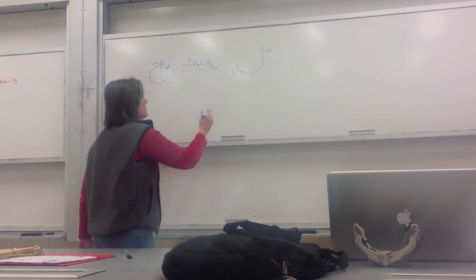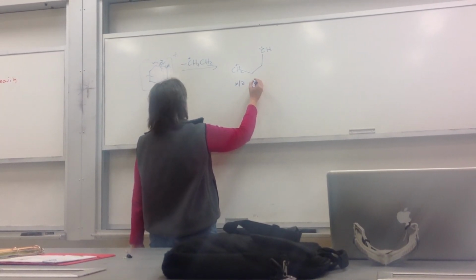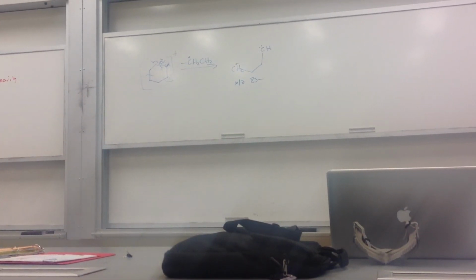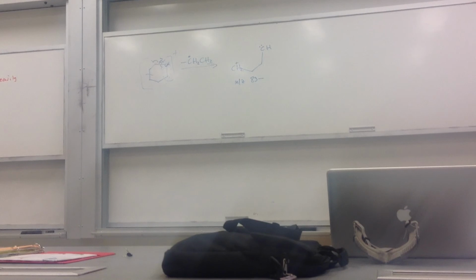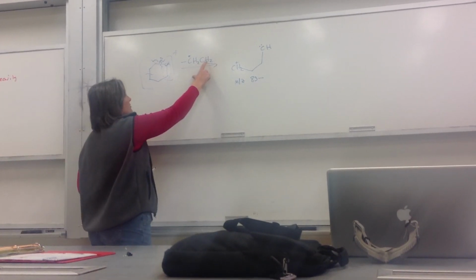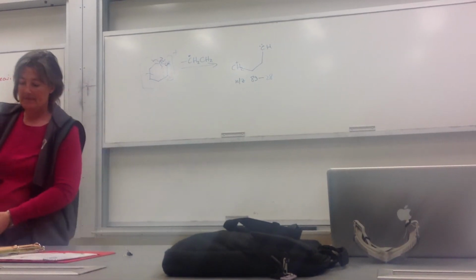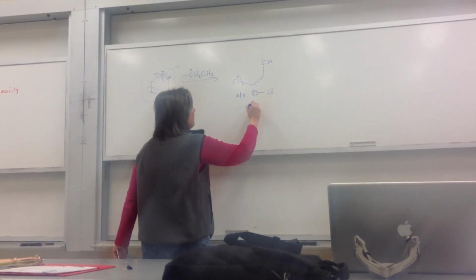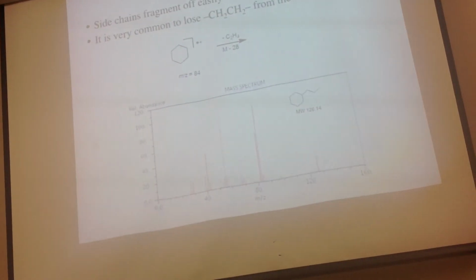And this guy's mass is what? 83 minus, what's it going to be? So it's going to be 30? Let's see. Here's 24, 25, 26, 27, minus 28. What are we looking for? 55? Yep. Yeah, I think, isn't that right? Yep. Do you see anything at 55?